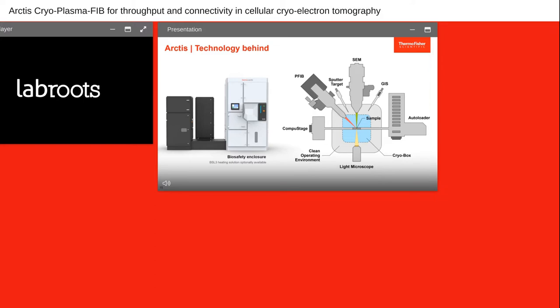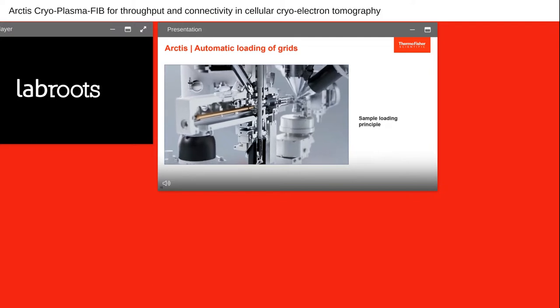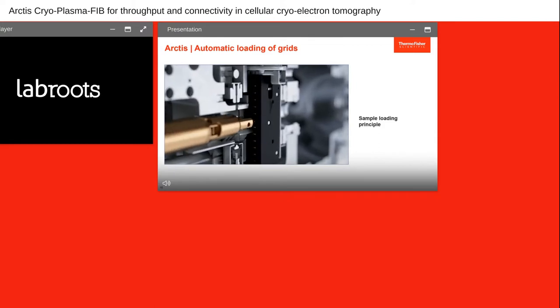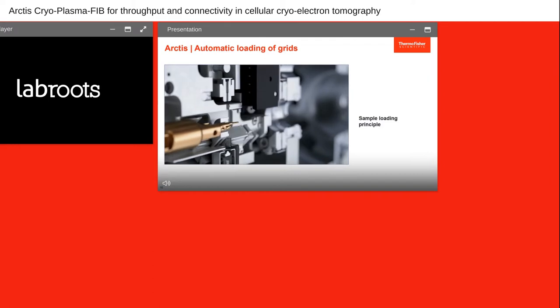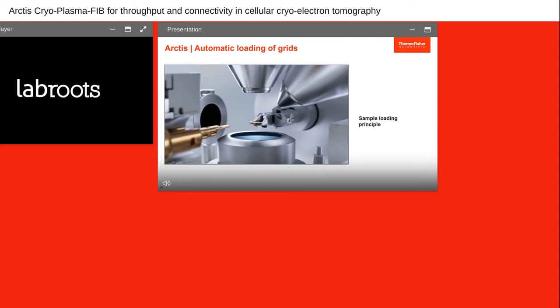This slide shows the sample loading of the Arctis system with the autoloader — a cut-open view of the robotic sample loading system. Once the user has loaded samples, the system picks up the samples from a cassette holding 12 grid positions. A gripper arm picks one grid and moves it into the high-vacuum chamber and into the Compustage, where we can manipulate it with the ion beam, image it with the electron beam, and utilize the fluorescence light microscope to detect fluorescence from the sample.